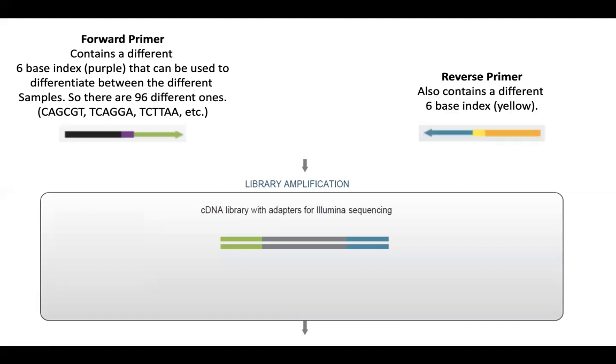your sample. On the other side, typically with RNA sequencing, the number of samples is not that big. So this is not used. So the primer is usually the same, so they don't use different indexes for different samples, but just stick to one. But if you have a lot of samples, also for like single cell sequencing, where you have a few thousand different samples, then you will also vary this barcode. And you have 2 different barcodes on both sides. Anyway, these primers are used, they bind to the sample.